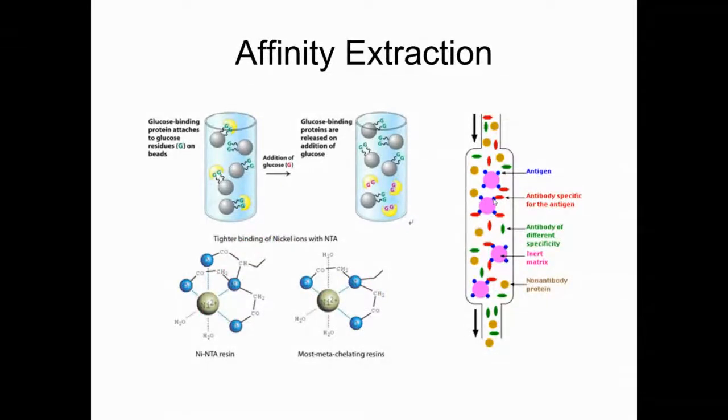And this is to show you the affinity extraction of the DNA. Oh, actually, this is wrong. This is not a correct explanation, the correct picture for the extraction of the DNA from the column, because some of the columns have a magnetic separation. Okay, so through the magnetic separation, basically the magnetic carrier with the immobilized affinity ligand prepared from the biopolymer has affinity for the specific target nucleic acid, and then you can use that to separate the DNA from all other components in the cell.